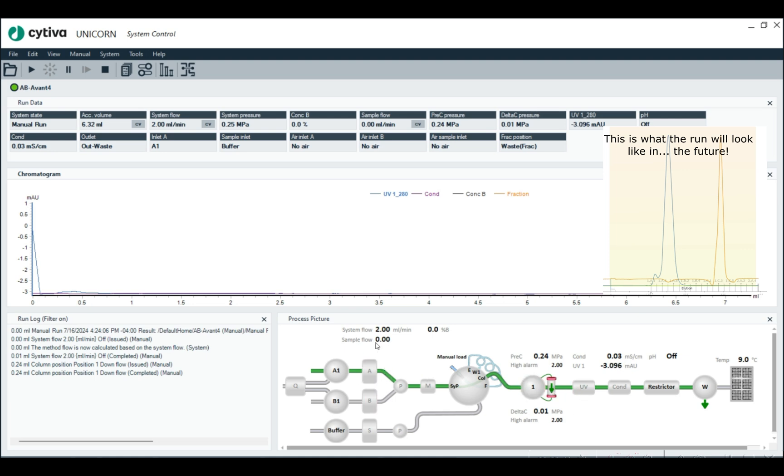Imagine we're doing an SEC run right now in manual. We have a column right here on the system, and we're running at two mils a minute, and we know those fractions are going to be, we know the UV is going to be going up sometime soon.